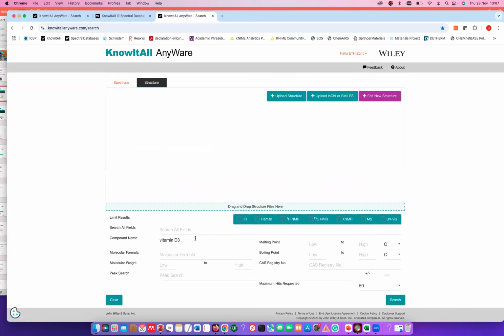I personally seldom search with names. I usually search with the CAS registry number. And I have here now an example. I have to find the number. For PMMA, so the polymethyl methacrylate, you wouldn't want to type that in because you don't know how exactly it is stored in the database. So we try just with the CAS registry number. And now I will say I want just IR spectra so that it goes a bit faster. So I tick that here, search.